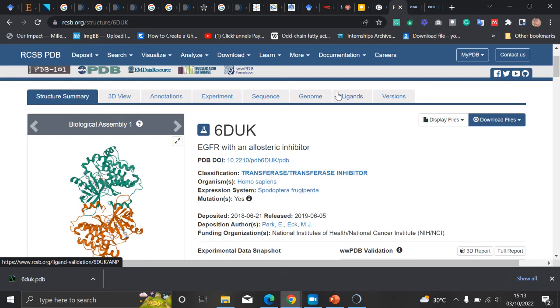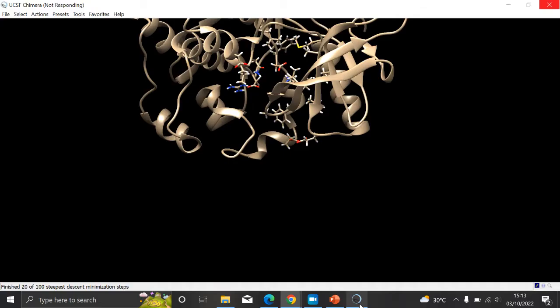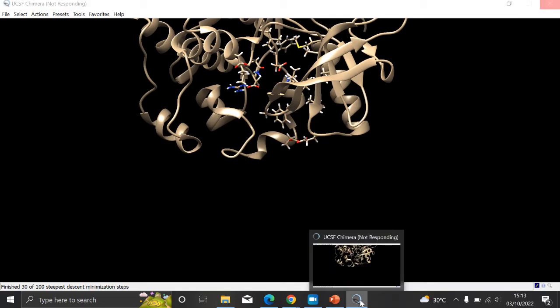So you don't have to view Chimera as a complex software. It's something that you can easily navigate. You launch Chimera, you want to load a file, you click on File, you see the commands that will come out: open, save, and so on. We all know what that means. If you want to do energy minimization, you go to Tools, then you go to Surface/Structure Editing. You are going to see Minimize, you click on it, and so on. So it's very easy to navigate.